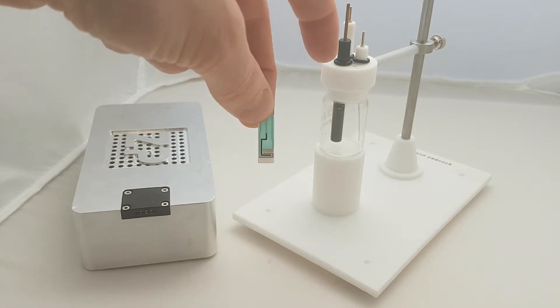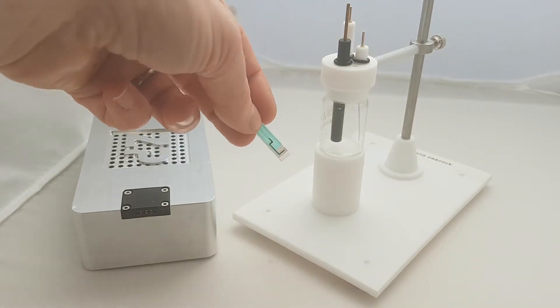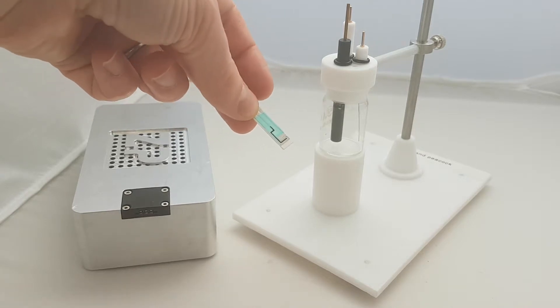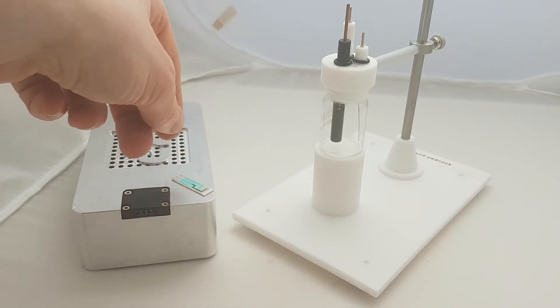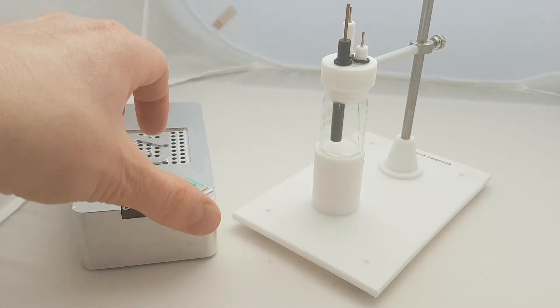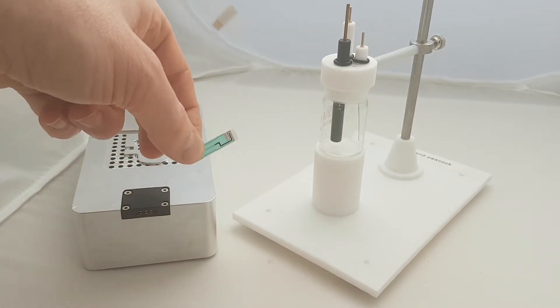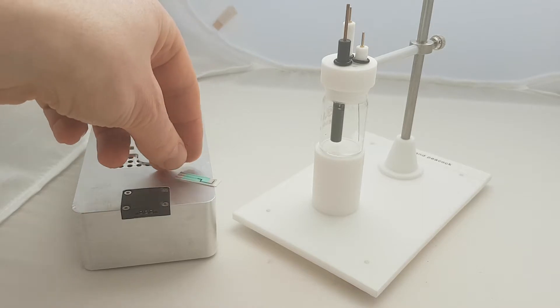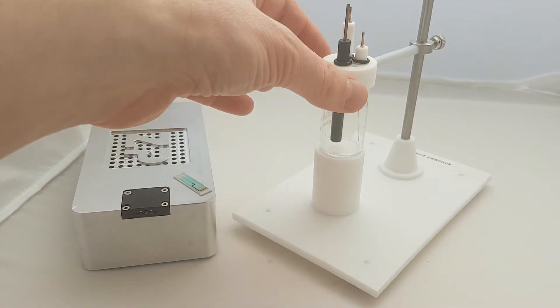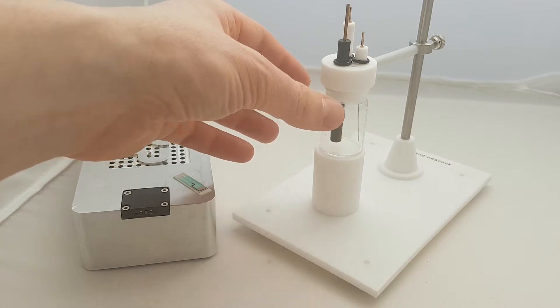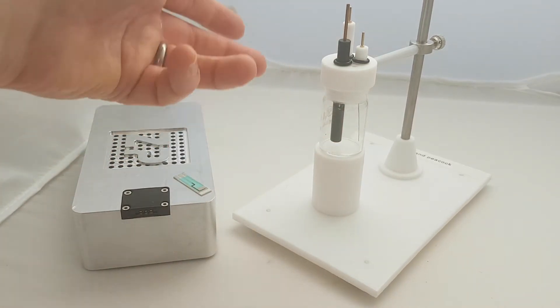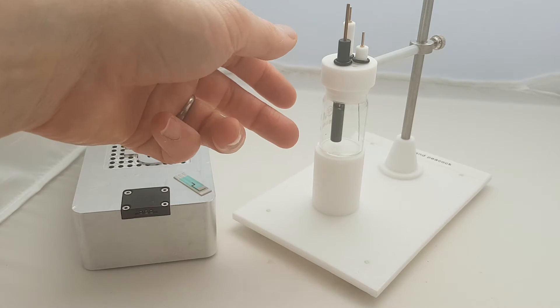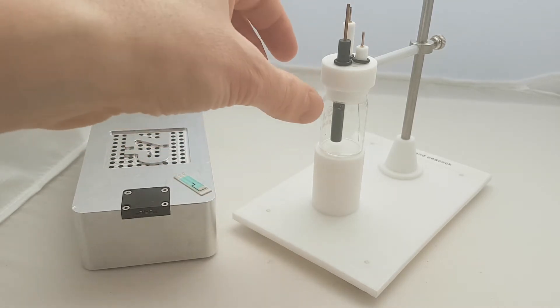But the cell is a step before necessarily doing some work on a disposable electrode. At Zimmer and Peacock the final aim is to actually make millions of sensors so that our clients and customers can actually get to market. But on our web store we provide an electroanalytical cell like this. It has a fixed setup so that's not a variable, the electrodes can be polished and reused so they're not a variable.